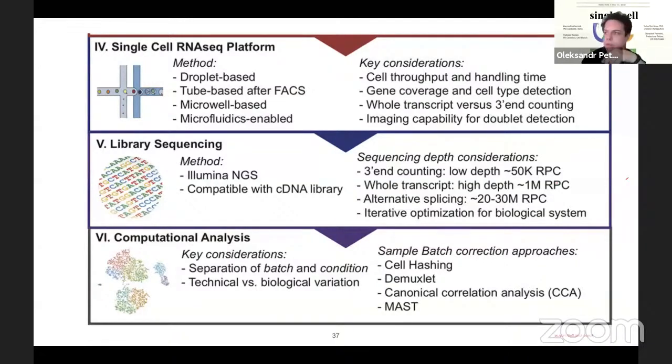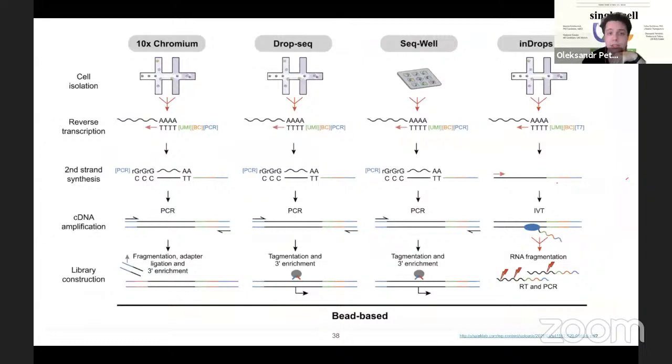Also, a question more about the biology of that. We have discussed the mRNA poly-A enrichment, or poly-A capture of mRNA. And Stanislav asks, what about other types of RNA? How is it possible to catch those molecules, which obviously do not have poly-A tails?